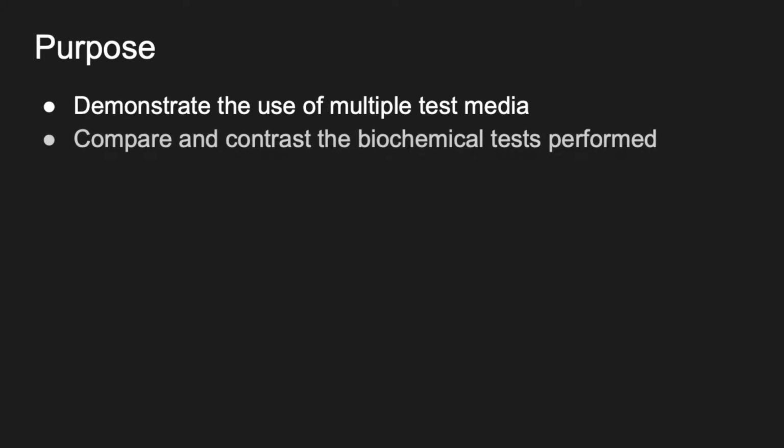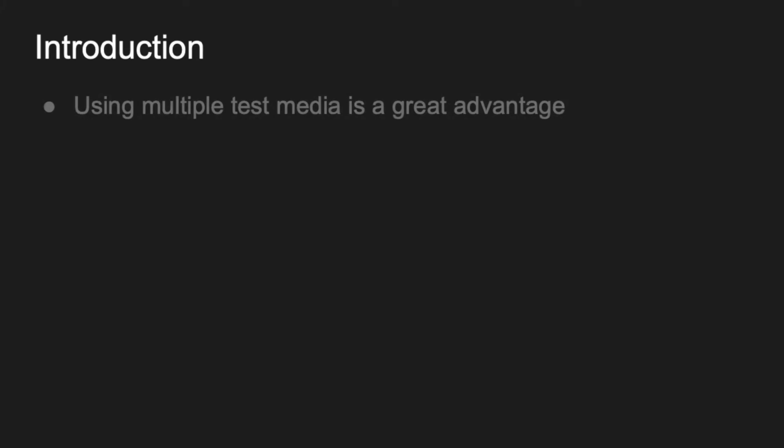Anyway, let's get into the purpose of today's lab. The purpose is to demonstrate the use of multiple test media and to compare and contrast the different biochemical tests that we're doing today. So just a short introduction.